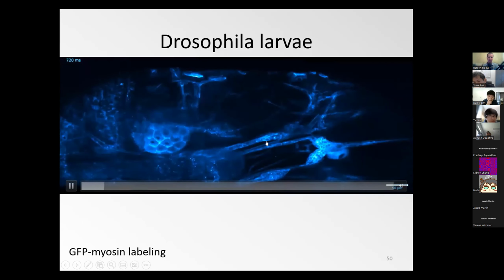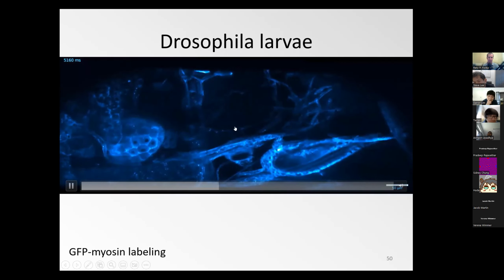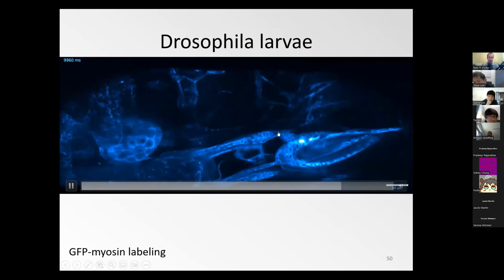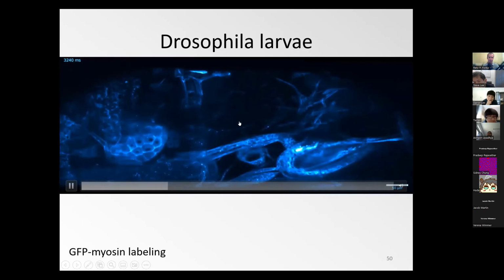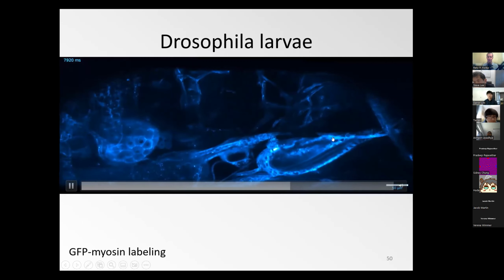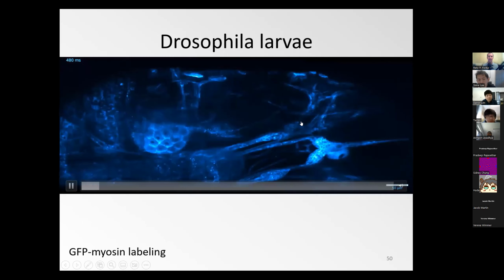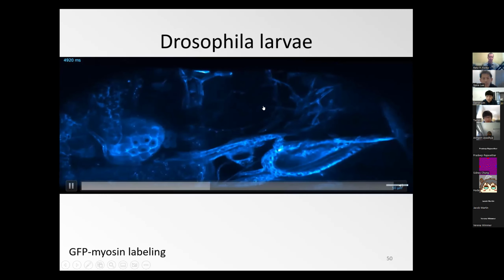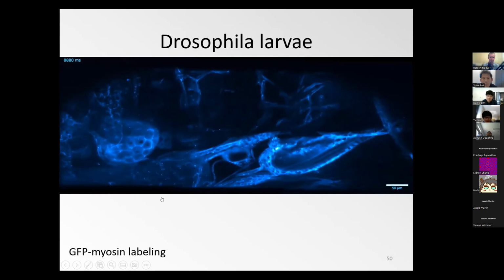Here, these are some other fast dynamics in the Drosophila larvae. So this guy has hatched. This is a myosin labeling. I think these are some muscle cells contracting. It's still just a subset of the whole larvae, but again, this was imaged at around 10 hertz. So also here, for the very fast dynamics, you would simply have no chance to acquire an entire stack to even get those views. Whereas here, each frame was a single camera exposure. And again, this covers a certain depth, a certain volume that was acquired here with the OPM.